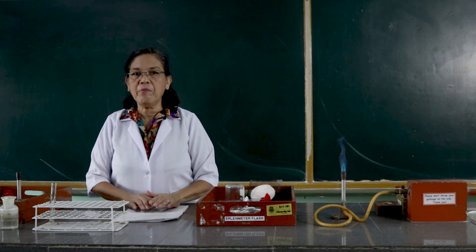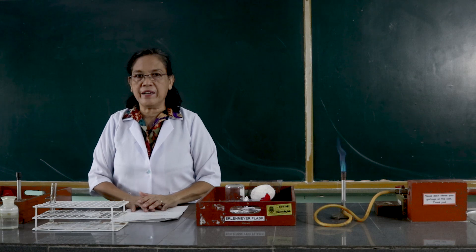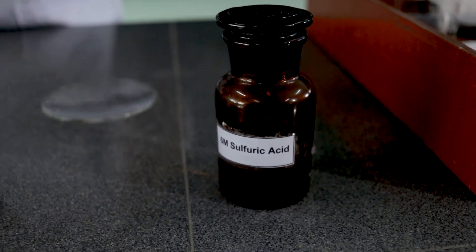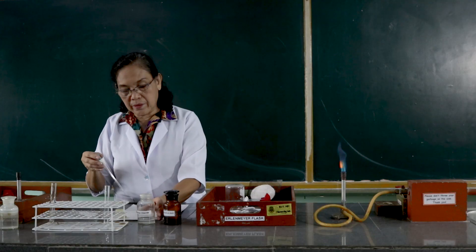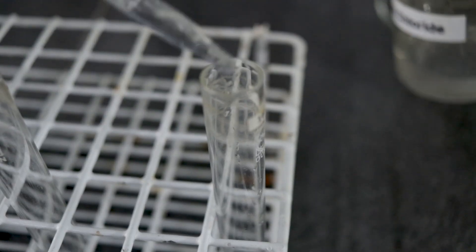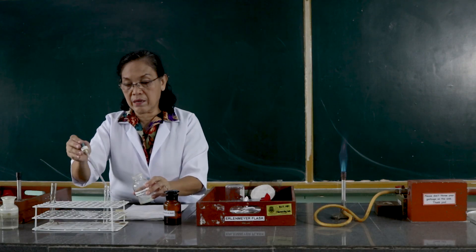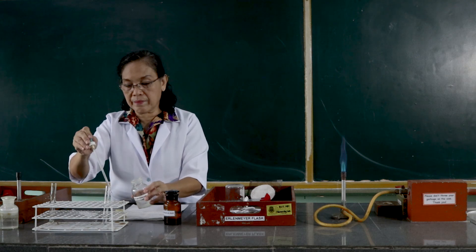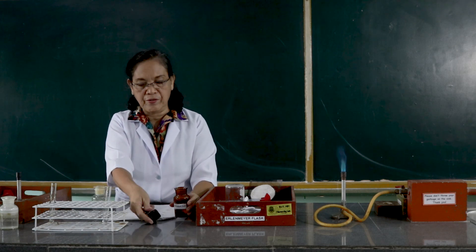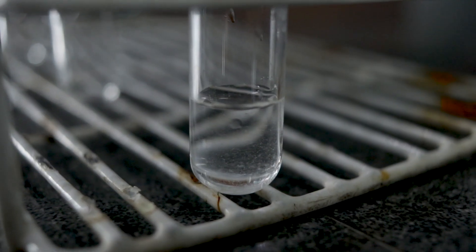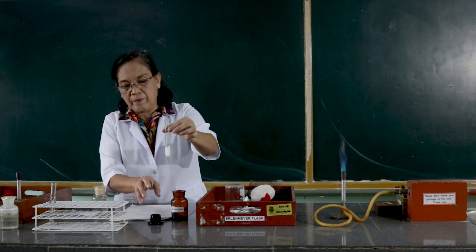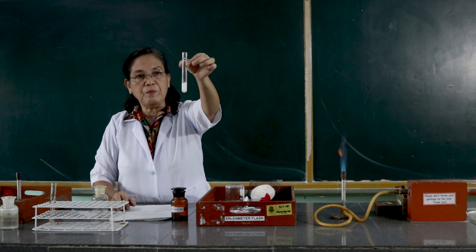We are going to exhibit the double decomposition reaction between sulfuric acid and barium chloride. We will get 3 ml of the barium chloride and add it with 3 ml of sulfuric acid. I want you to observe what happens.